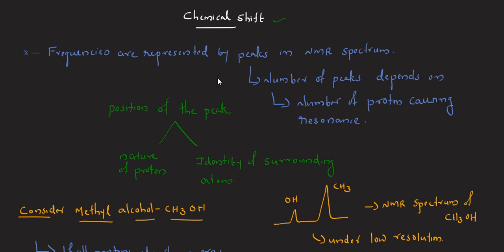Also in NMR there are different peak positions. The position of the peak depends upon the nature of the proton and the identity of the surrounding atom, to which atom the protons are surrounded.